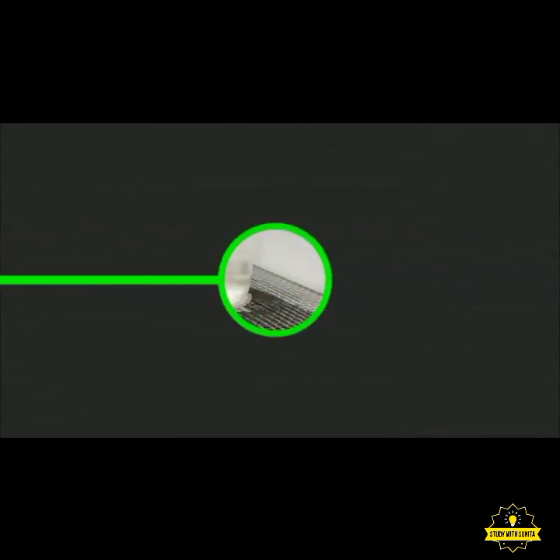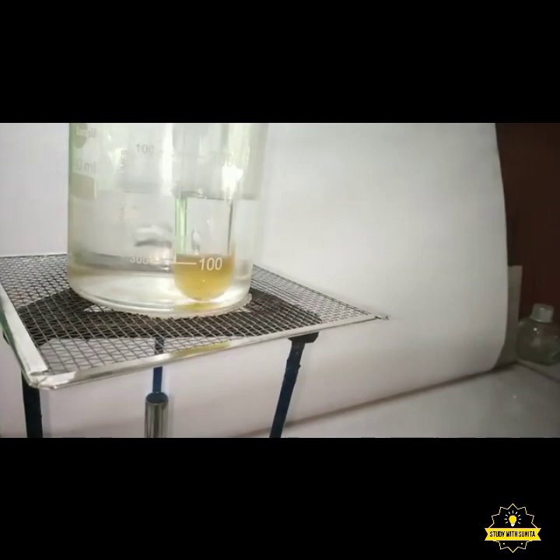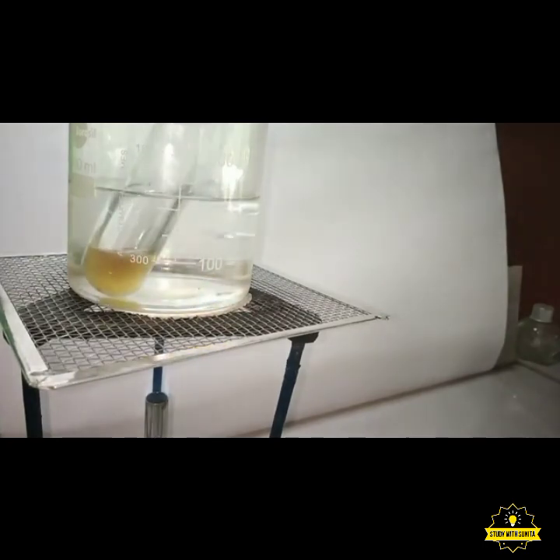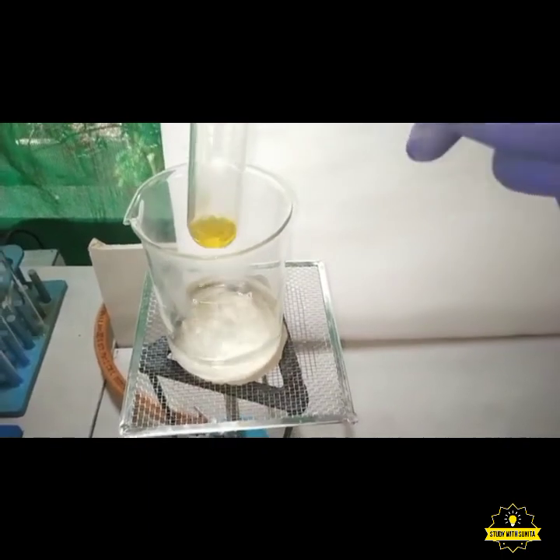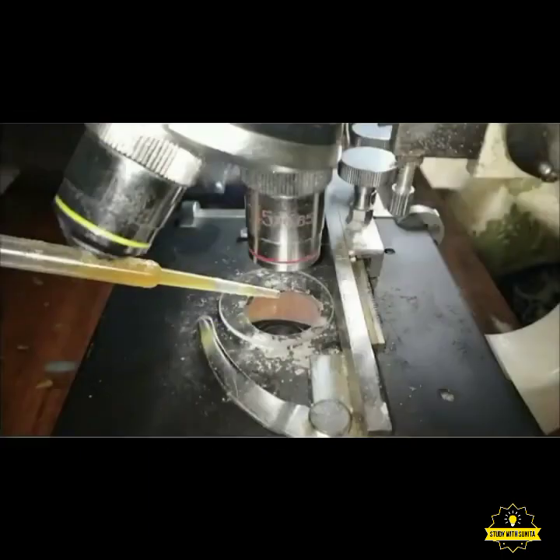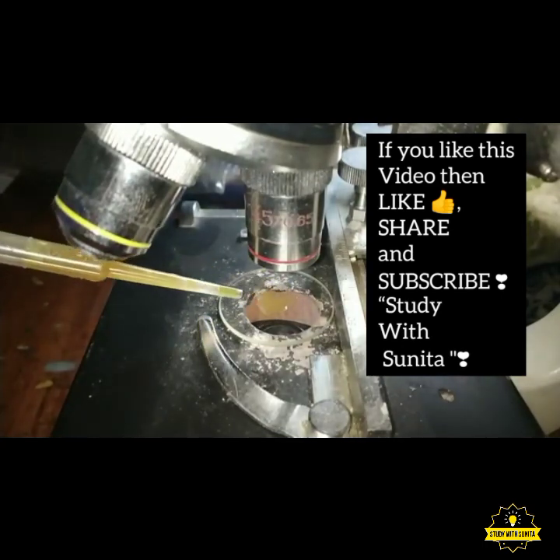We will keep it in a boiling water bath for 25 to 30 minutes. After 25 minutes, we take it off the boiling water bath and cool it under running tap water. Now we observe the crystals under a microscope in high power field.